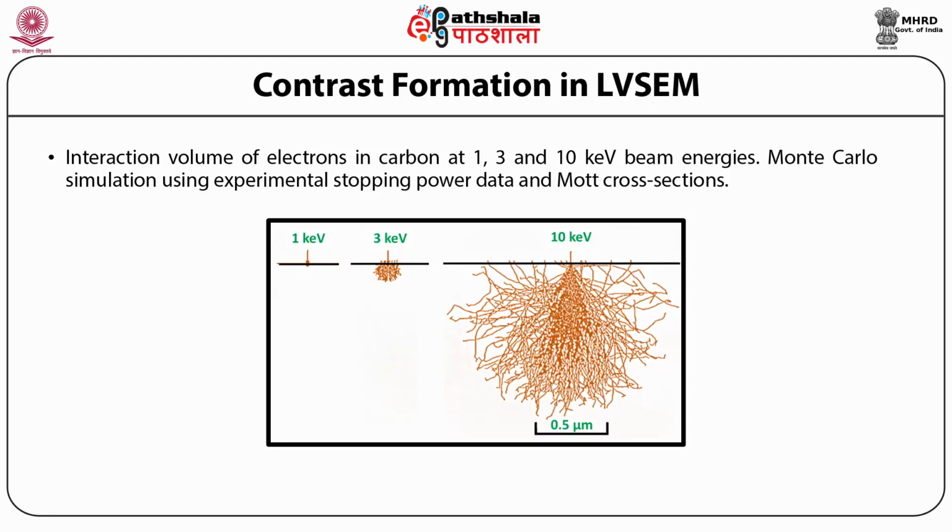At low voltages, the beam penetration is small. All faces of the sample emit about the same number of secondary electrons. The features raised on the surface no longer display enhanced secondary electron emission, leaving only the detector contrast contribution to measure. As a result, the SEM image appears flatter, less dramatic, and the true nature of the specimen surface is hard to discern.